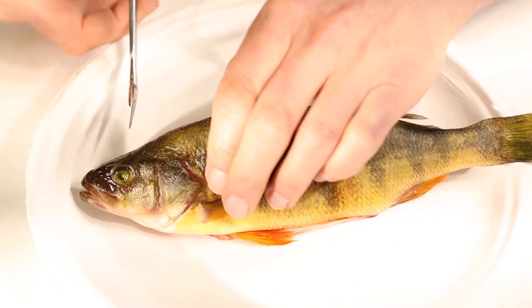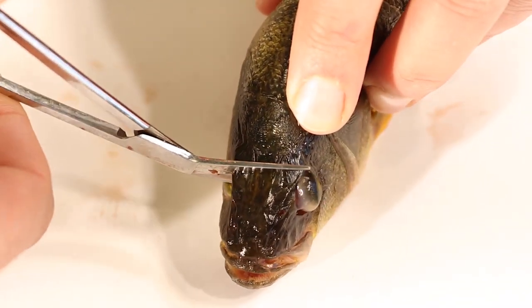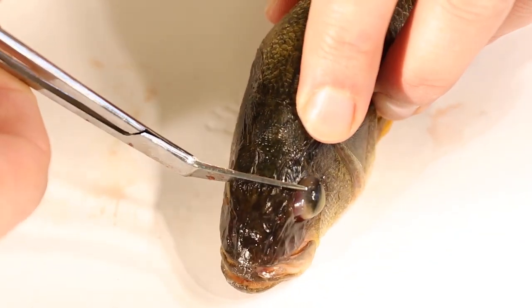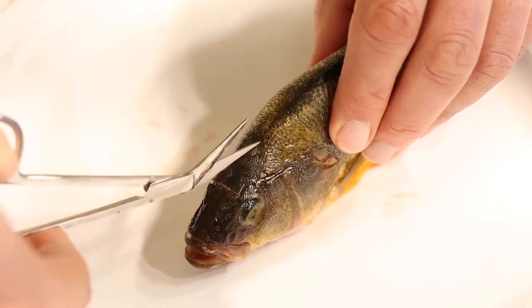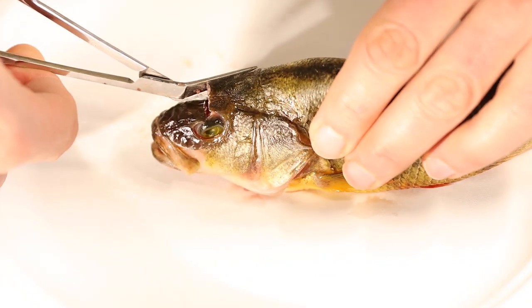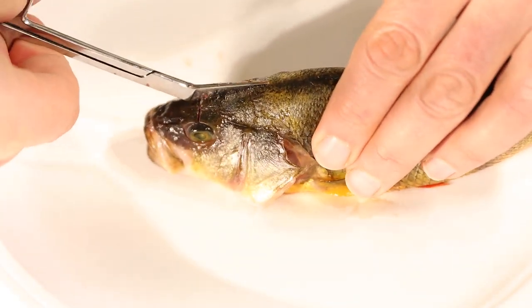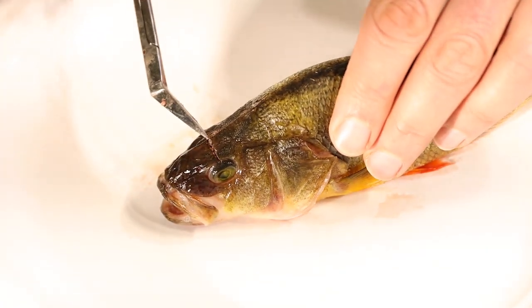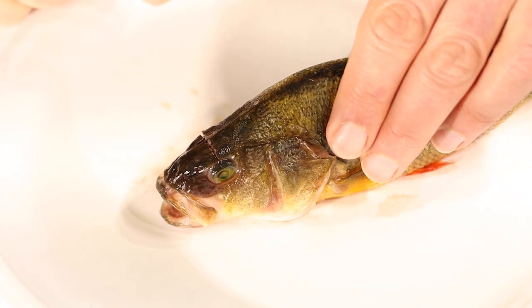We're going to start by going from one eye to the other on the perch, just right down its skull — we'll cut through the skull there. Then we have to turn and cut right up the fish's skull without cutting too deeply, because the brain is inside and we do not want to touch it with our scissors. So we've got two cuts: one cut this way, and one cut this way.